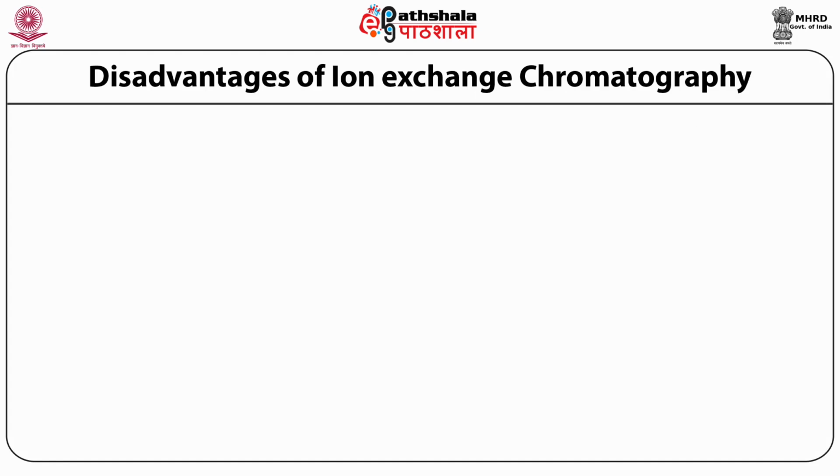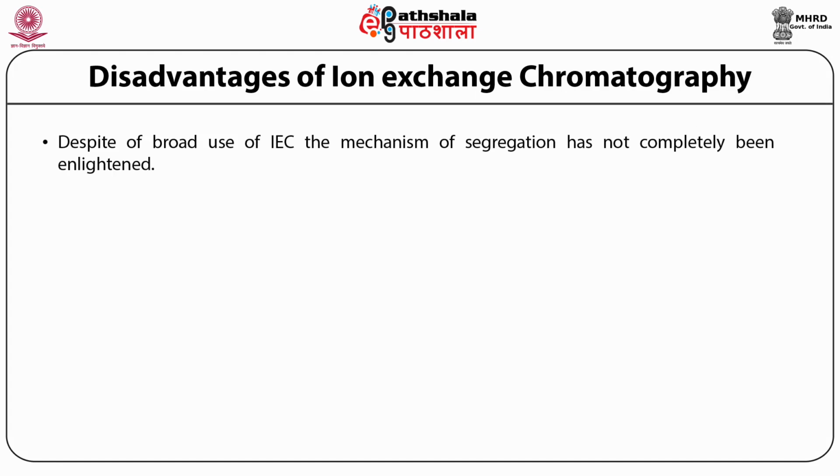Disadvantages of IEC. Despite the broad use of IEC, the mechanism of segregation has not been completely elucidated, and extensive effort has been made to depict the ion exchange process more theoretically.